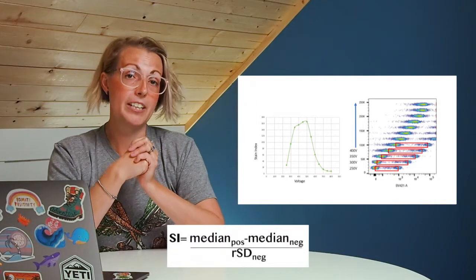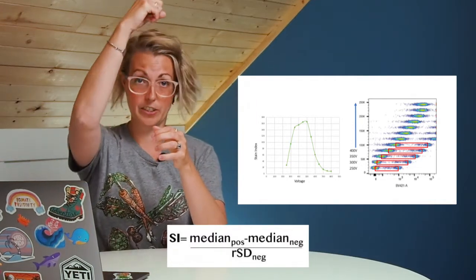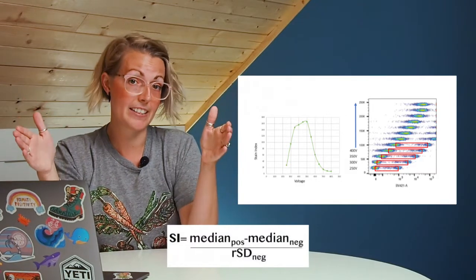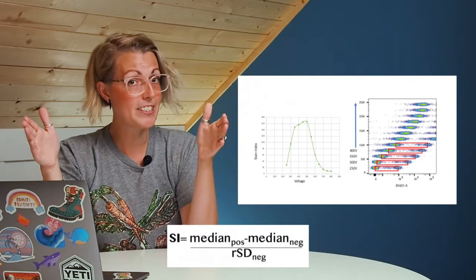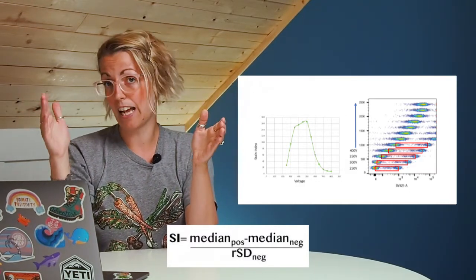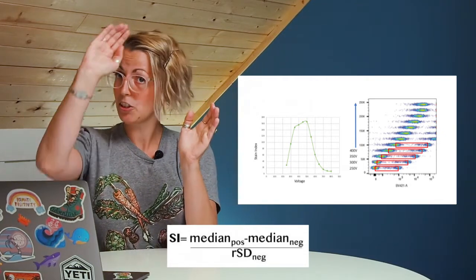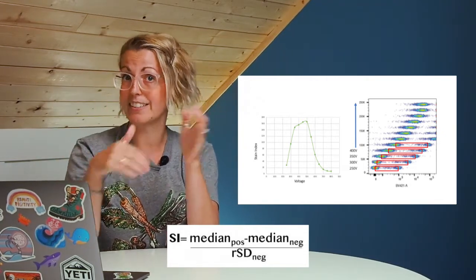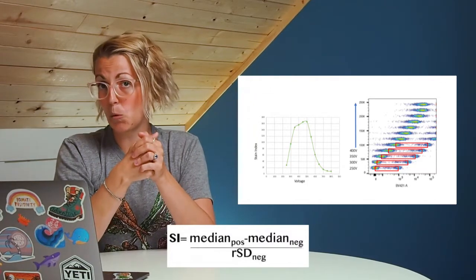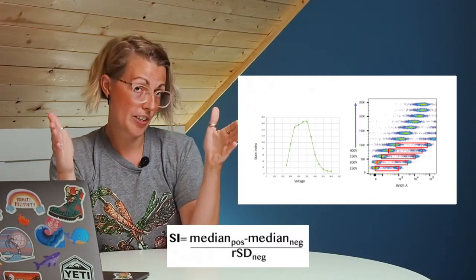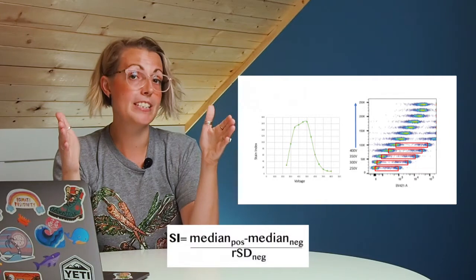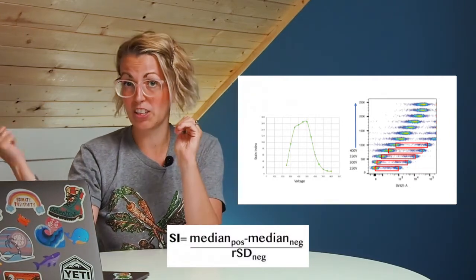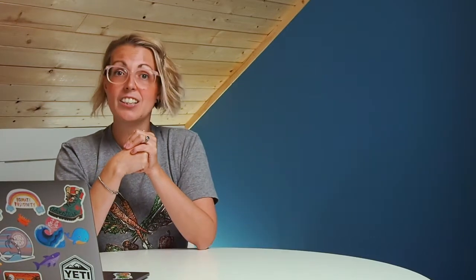As we increase the voltage, our stain index increases to a point because we've maximized the difference in signal between the negative and the positive. Then you'll see a turning point where we start to drop in stain index. This is the point where our background spread is starting to decrease that resolution. It's also the point where we've lost our positives and they're too bright, so it would not be an ideal voltage to be using.